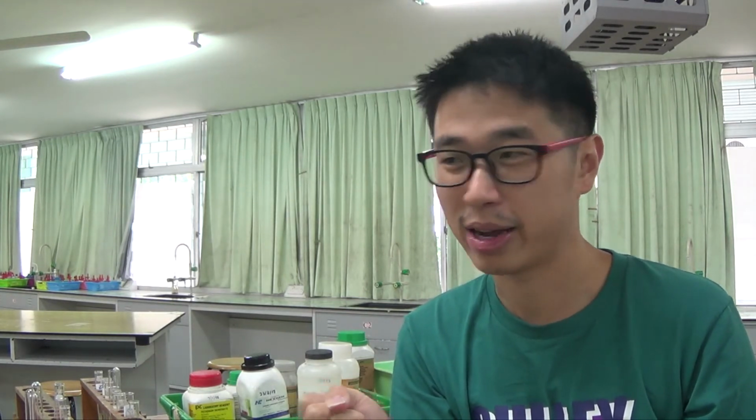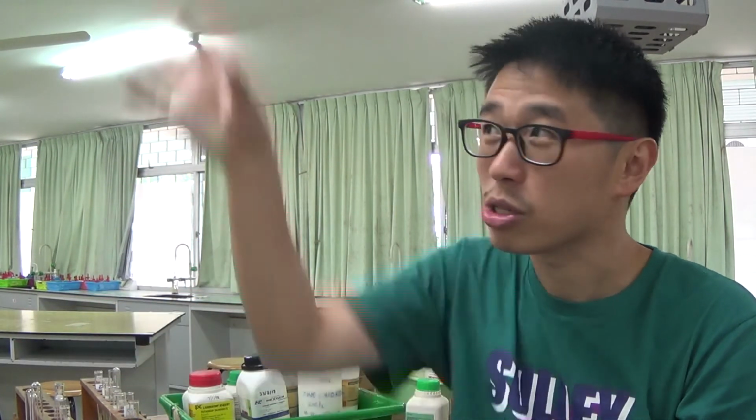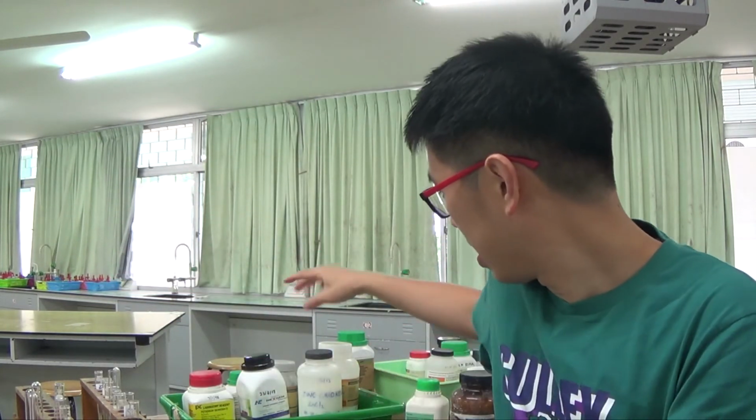I don't want to let it stain my shirt or whatever, because it is very oxidizing, and the intense purple color, you will have used it for titration, or you have seen it before, definitely. You can watch my other tutorial video on the redox titration between acidified KMnO4 with Fe2+, and you can see how intense that purple color is. And that was the original solid that you make up the stock solution that you fill in the burette or sometimes in the pipette.